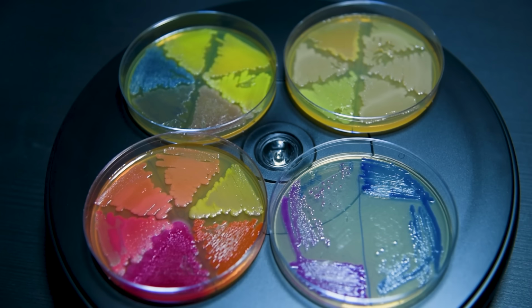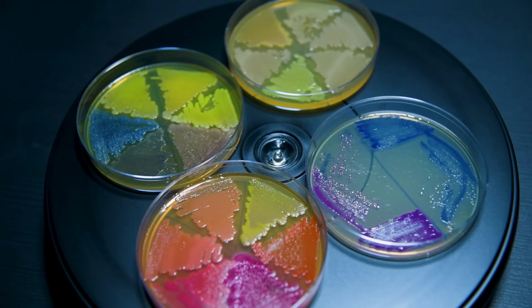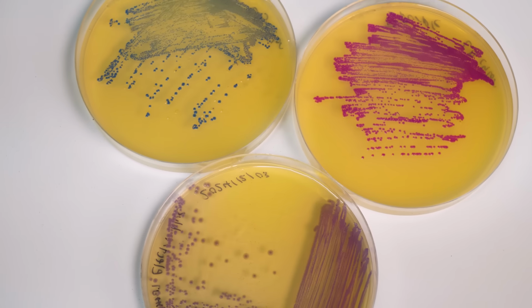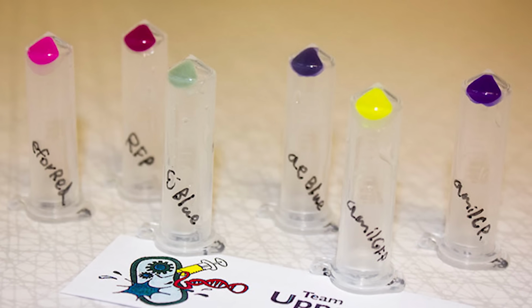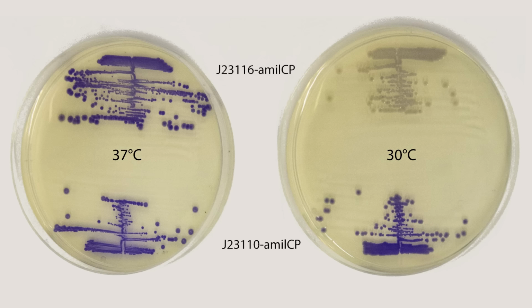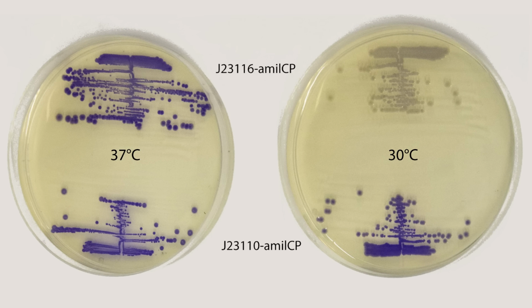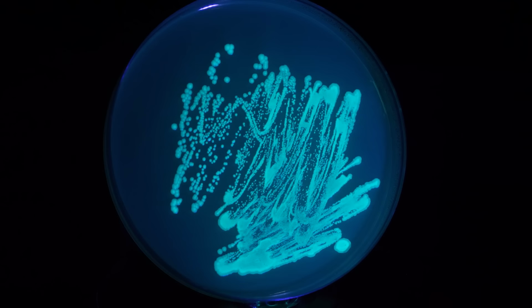Okay, now that we've got the basics done, let's ramp up the complexity. As I said earlier, there are a lot of fluorescent proteins to choose from. Some don't even glow, but instead are brightly colored in white light. Probably my favorite of those is called AmilCP. It's a gorgeous shade of blue, but it has always bothered me that you're forced to choose between something that either looks blue or glows blue, but never both.